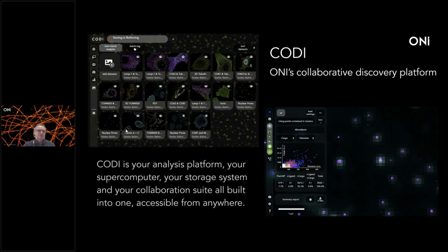The interface looks like this, what you can see on the top. After uploading the data, you can perform multiple steps to perform the analysis, and that's how you get the information. If you open an individual data set, such as here, you can see that there are some different steps. Briefly, in the first step, you will do a drift correction. I mentioned that this technology requires imaging multiple frames. So when you image for a long time, let's say 5 minutes, you start to see a thermal drift, so your sample starts to move, so we need to correct for it. The software does it for you.